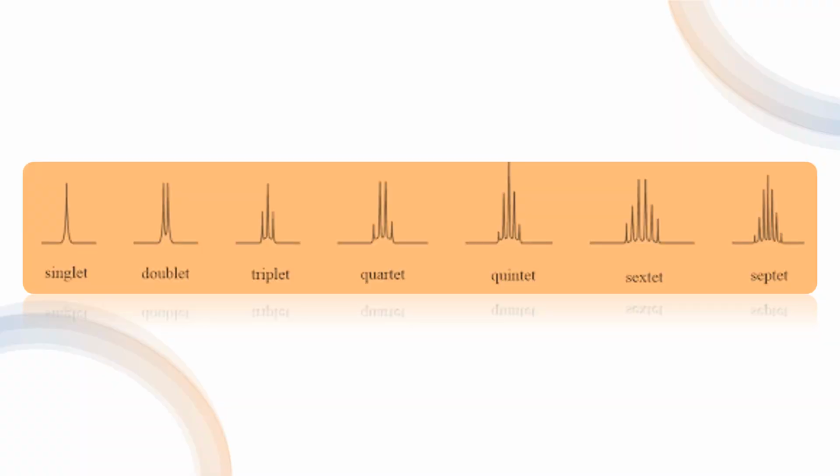In NMR spectroscopy, the splitting of peaks, known as multiplicity, arises from spin-spin coupling between non-equivalent neighboring protons. This splitting provides valuable connectivity information in a molecule. Let's break down the common splitting patterns you see here.